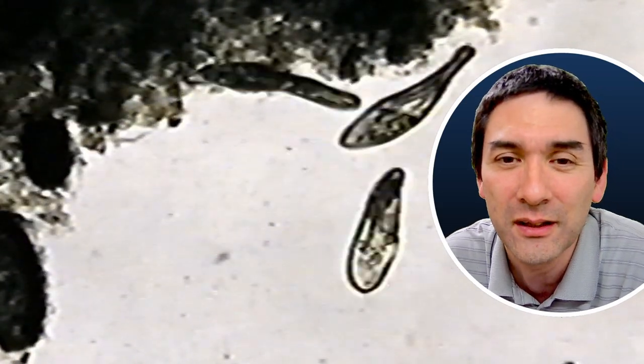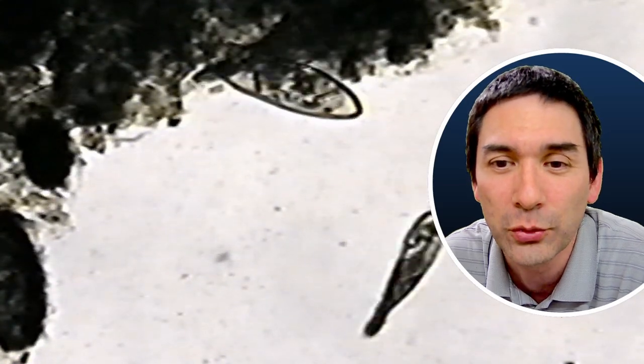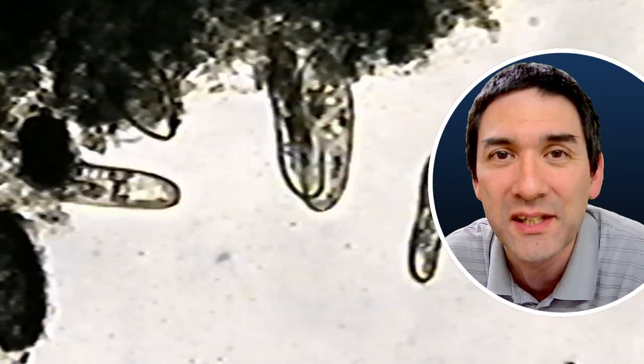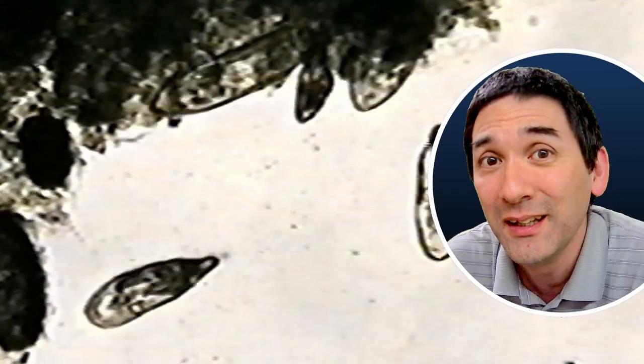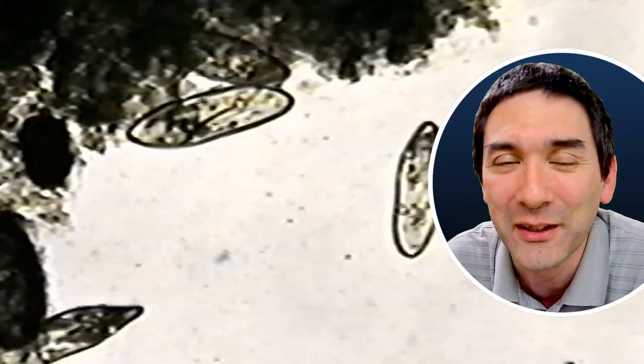But look at this, the paramecia here, they have a funny shape. They start to spin, and they're extremely thin now. And the reason is because I added some salt. I mean, even experimenting around at that time. And the salt has now pulled out the water of the cells by osmosis. And they start spinning, and then they stop moving.